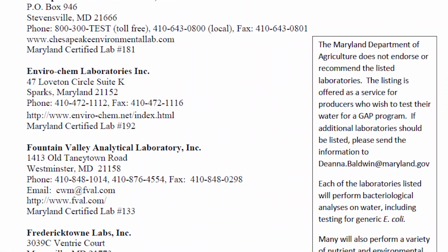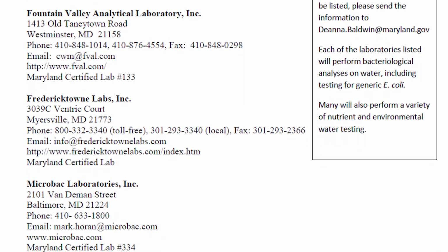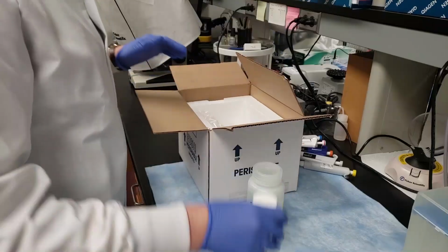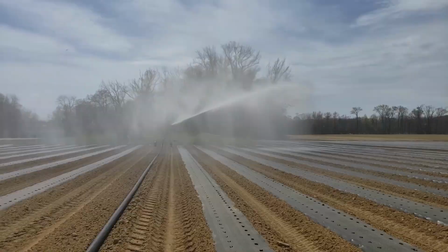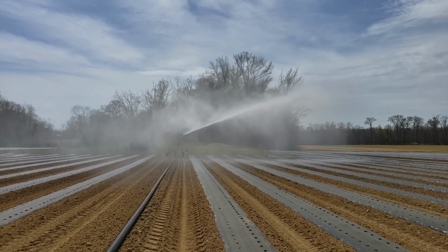The first step to testing your water is to find an approved local water quality analysis laboratory. This lab will provide you with a sampling kit, which you will send back to them after collecting your water samples. Be sure to contact your local lab and follow specific instructions they may provide. This video will review the general protocols for sampling water to obtain accurate information about your water quality.